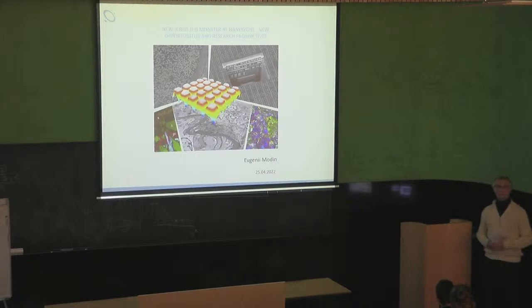But when doing so, we realized that it's potentially a unique opportunity for the Basque country to acquire equipment of this level or with these capabilities, and we started to think how we can extend the capacity of this tool to serve the community more. And the next obvious candidate was nanoGUNE with the batteries, and the thing which we needed to fulfill their request is, let's call it a high rate removal option, which would mean we should have a super strong focused ion beam.